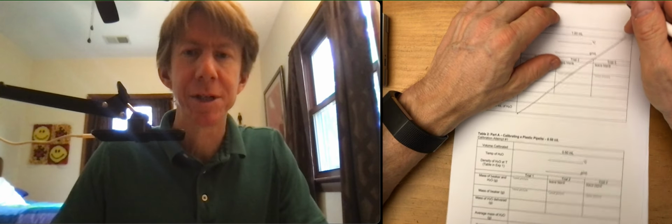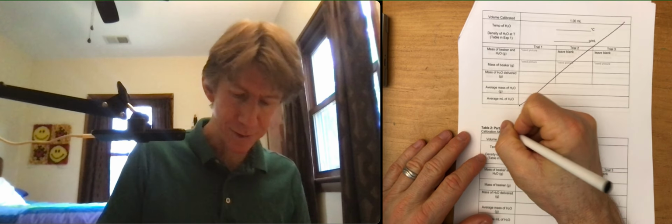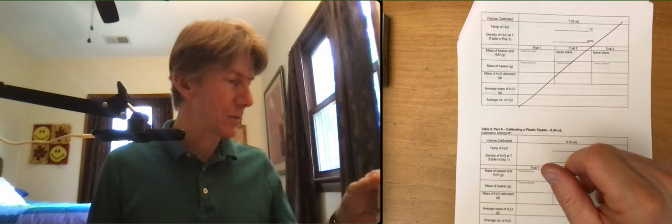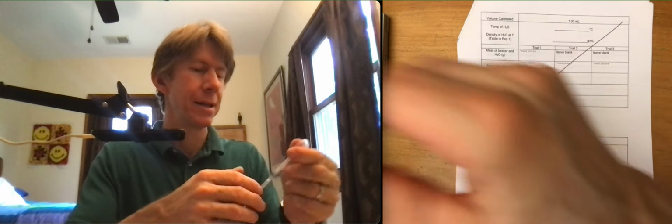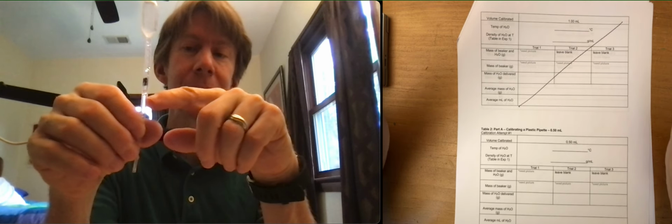A few words about doing it for the 0.5 milliliter calibration. I don't know if that's part A. We'll fix that too. But this is table two. So you've got your pipette, and if the one mark is up here, that 0.5 milliliter mark is about in the middle. And I have no idea what you're going to find because I have not calibrated mine for 0.5 milliliters. I just did mine for the 1 milliliter up here. But you're going to end up with a line somewhere above or below it.